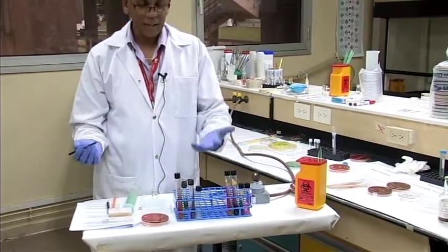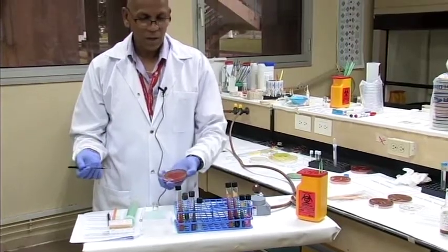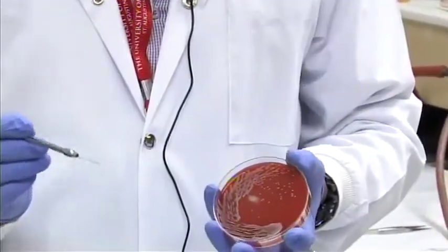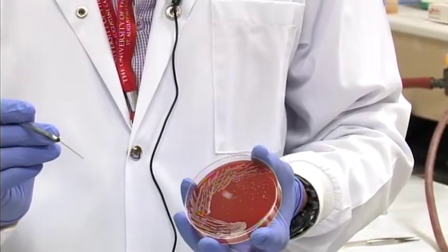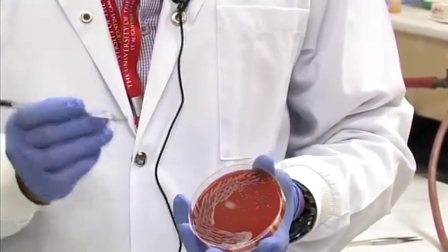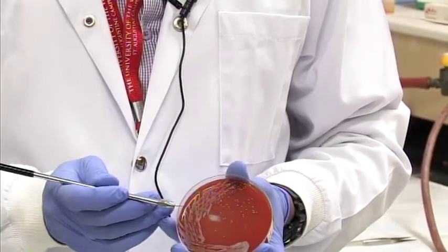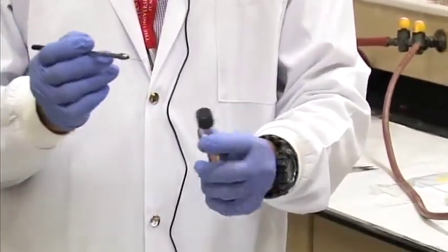Again, you're not supposed to be speaking while doing this test, but for demonstration purposes, I'll be explaining through the procedure. The wire will have cooled within 5 seconds, and we're going to touch one colony. A good trick to remember is that you must work with one colony throughout the process. So you choose a representative colony and just take a little touch there. You may not see it, but once you see the colony move, it means you have picked up bacteria.